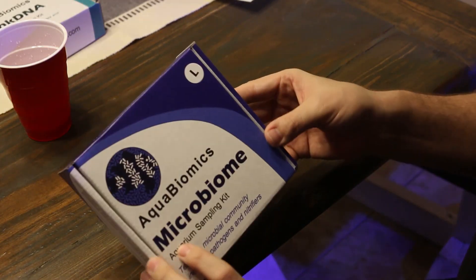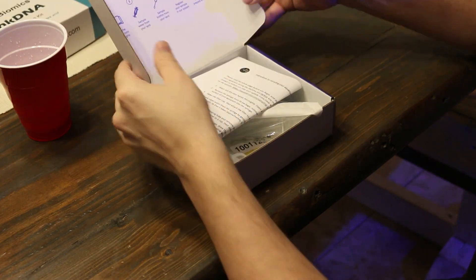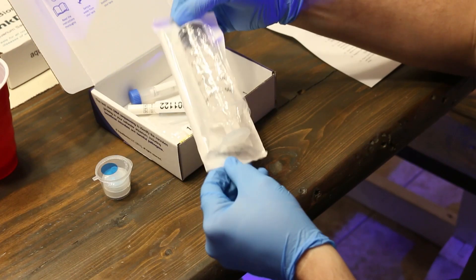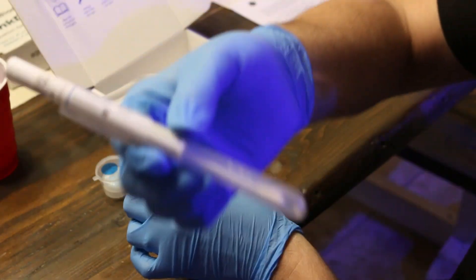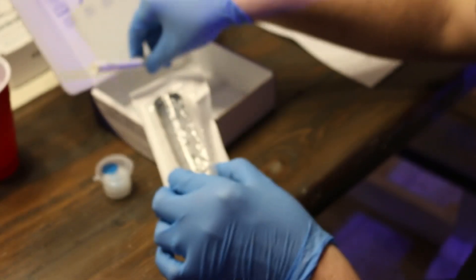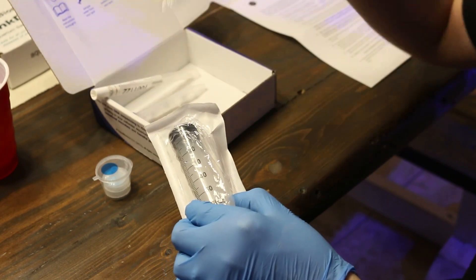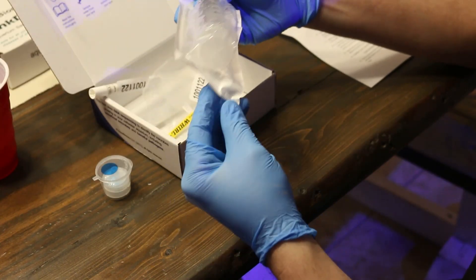Now it's time to do the microbiome test. Just like before, this test includes a pair of gloves, a filter specifically marked for this test, and a syringe to collect your water sample. You also have a cotton swab that will be used to collect a sample of the tank's biofilm. Also included are two fixatives — because there are two different samples being collected — as well as the sterile bag to put everything in at the end.